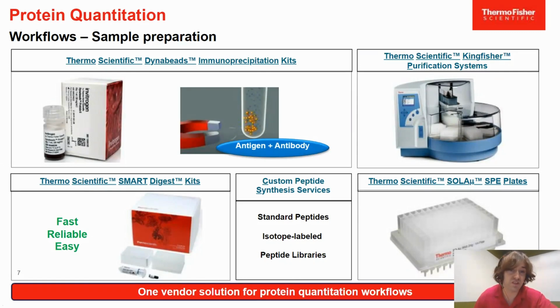Protein A and protein G coated Dynabeads both allow enrichment of monoclonal antibodies. Epoxy Dynabeads combine any protein, making them ideal for less specific enrichment, such as just separating proteins from other components of the sample. And streptavidin, which can be used to enrich biotinylated antibodies.